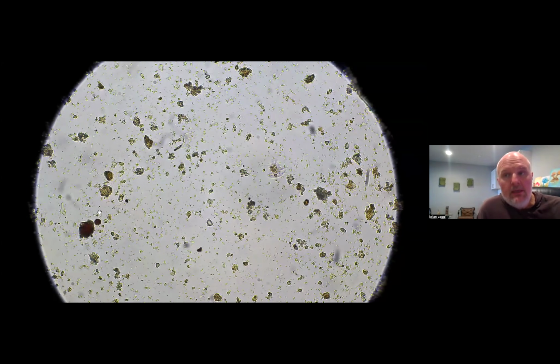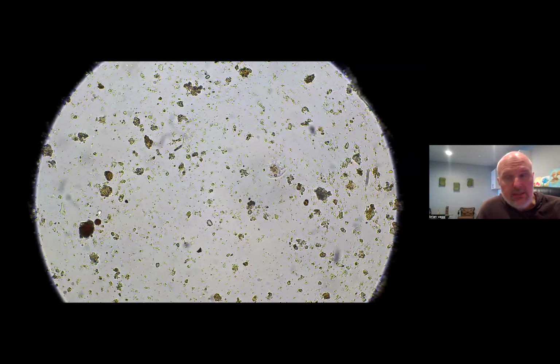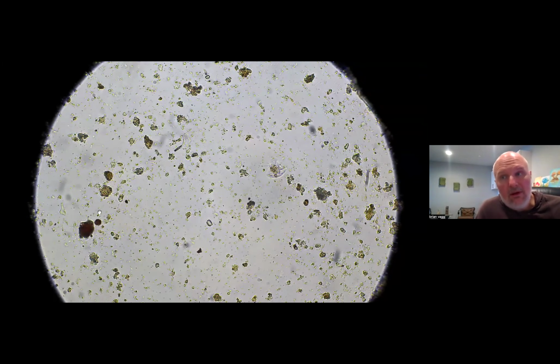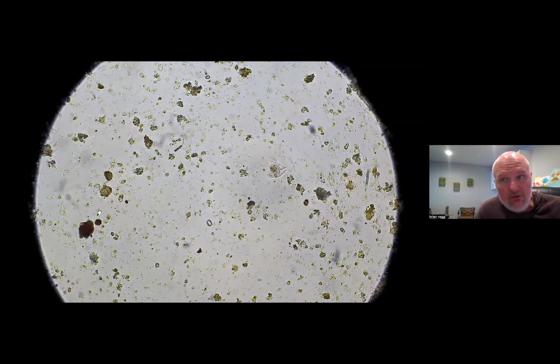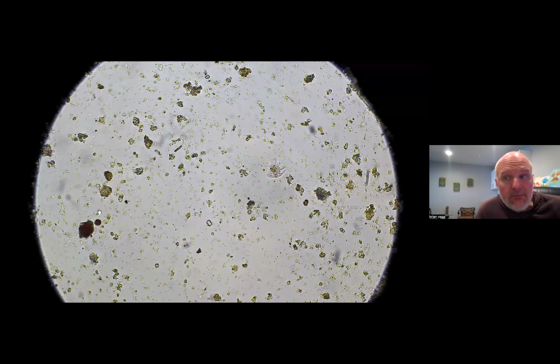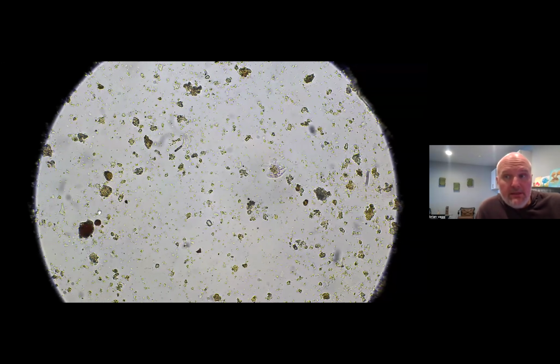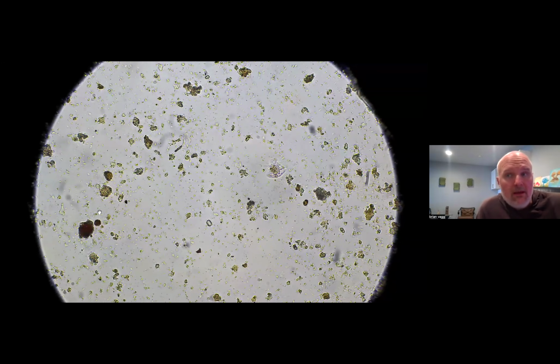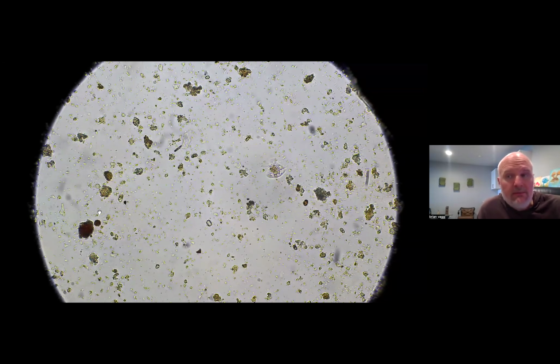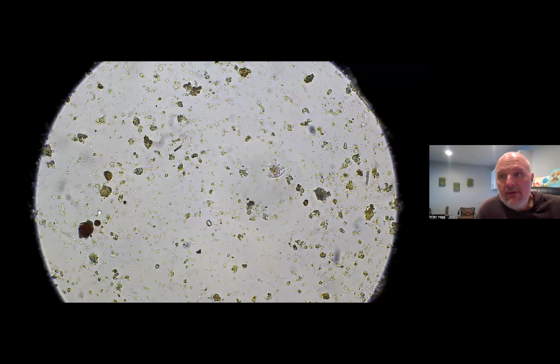As I've been putting in compost and compost extracts and looking at the soil, I'm noticing those changes. That aggregation is becoming more developed. I'm getting more of the microbial community, that soil food web is actually building into those beds. So it's really important. And in the work that I do, when I go to apply a compost or compost extract, I'll take a look at it just to make sure that it is at that microbial quality that I'm looking for.